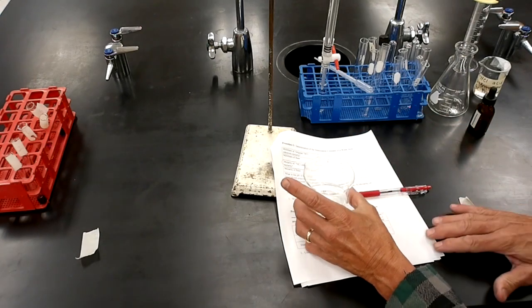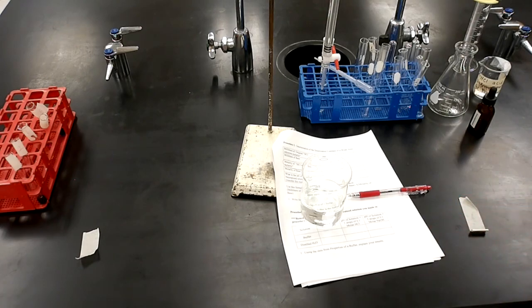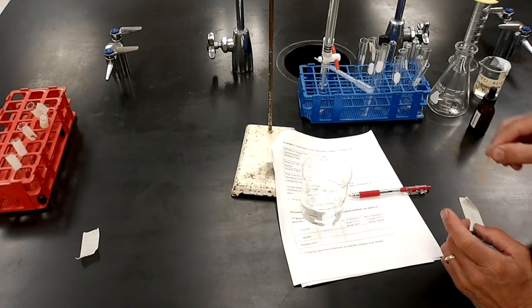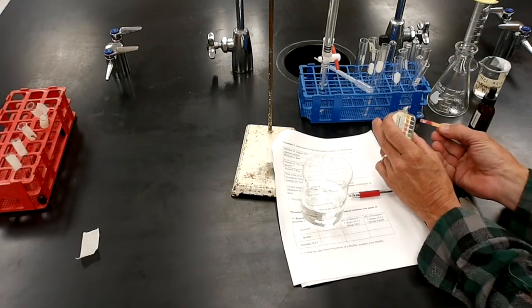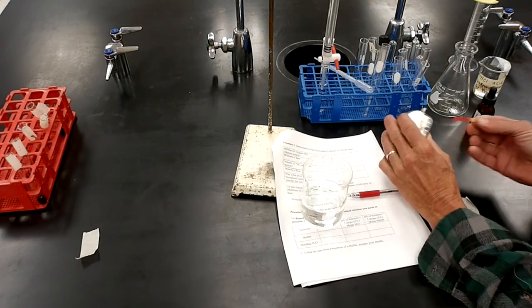Now, what I'm going to do for this is I'll get some pH paper and I'll measure its pH approximately with this. And that looks like it's got a pH of about, I'm going to call it 2.